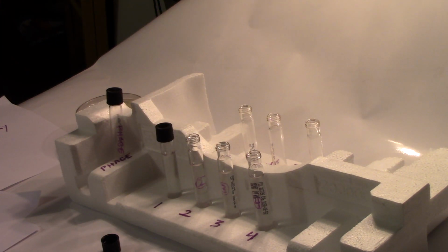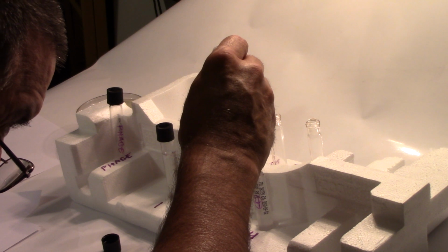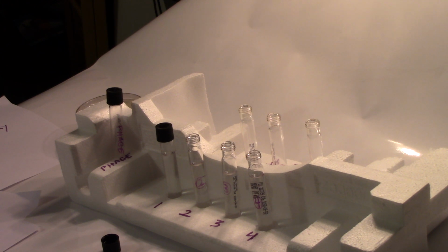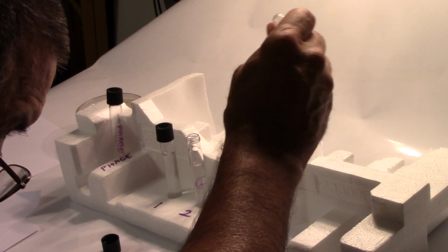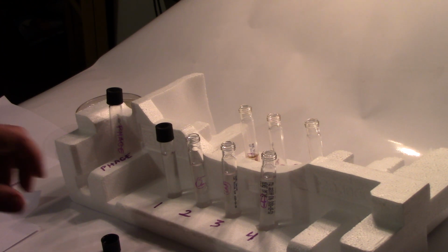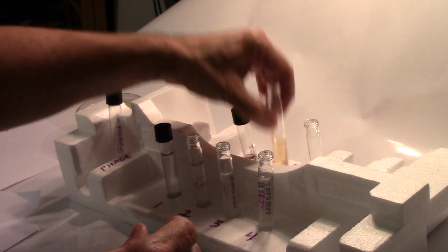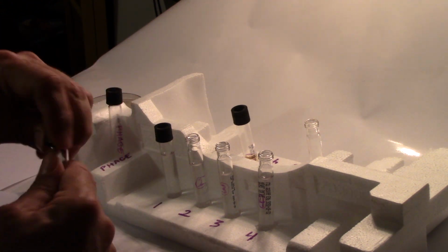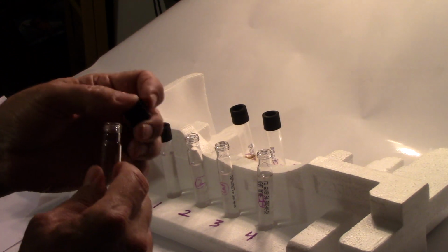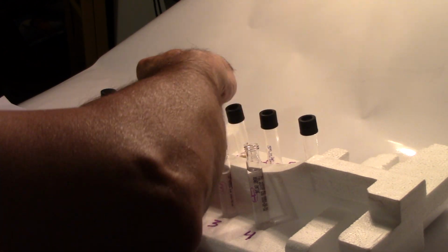Get another pipette. Add 200 microliters of the next to my number 3 soft agar overlay, and then from my tube number 4, same thing. Now, next step is I will mix these. It has my soft agar overlay that's warm right now. It won't be warm for long, but for right now it's nice and warm. It has phage in it. Let me close these dilutions.